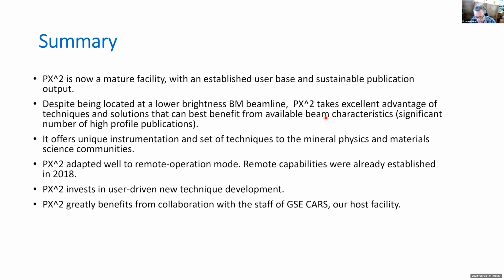samples. Our goals for analysis of multi-grain samples are a little bit different than what Quentin was discussing. So we would be interested in merging data, indexing data that come from these differently oriented grains, and merging them together to increase coverage and redundancy of structural information, and to provide unambiguous indexing of the high pressure phase if you don't know what the structural arrangement is.